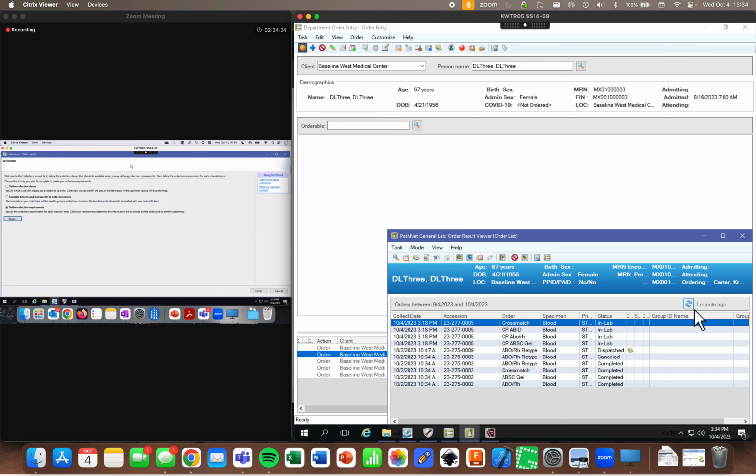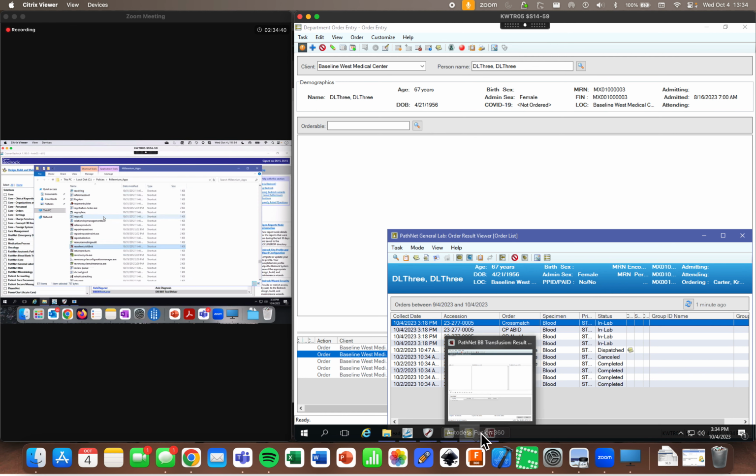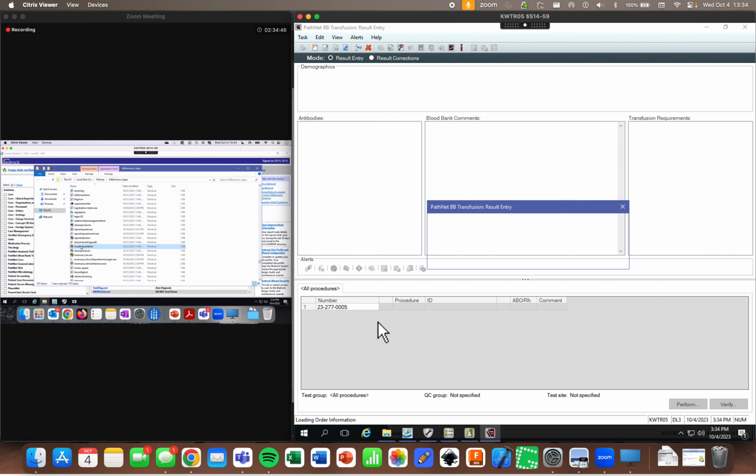Let me close out of some of this stuff here. Over here to my Millennium Applications folder, and I am looking for result entry BLDBNK. Result entry blood bank.